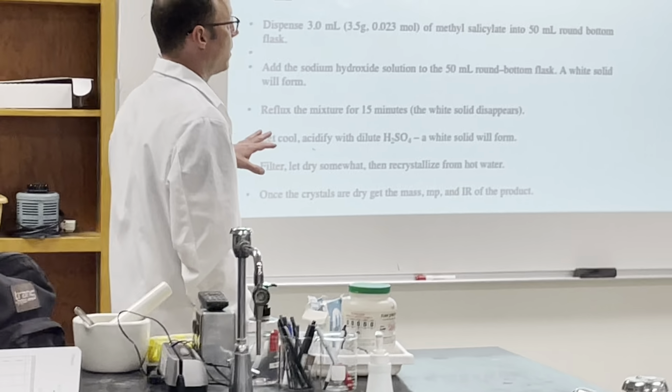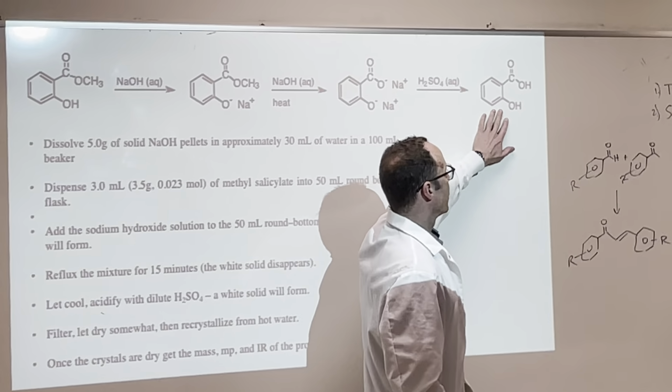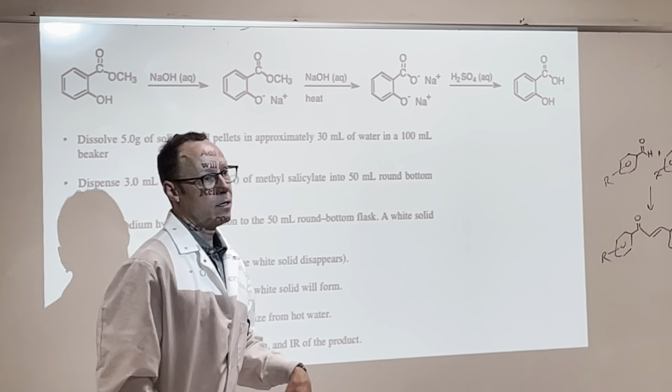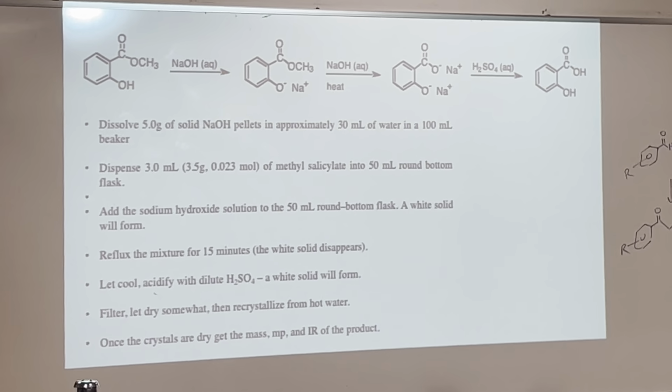Second half of the aspirin synthesis. So all of you, or most of you, I think, are at the point where you have your salicylic acid. So we're going to take the salicylic acid now and convert it into aspirin, which is just acetylsalicylic acid.